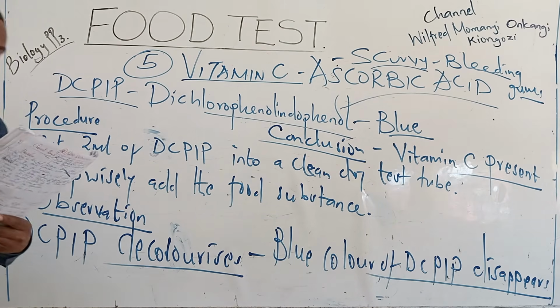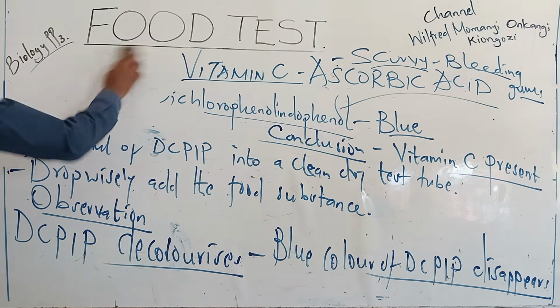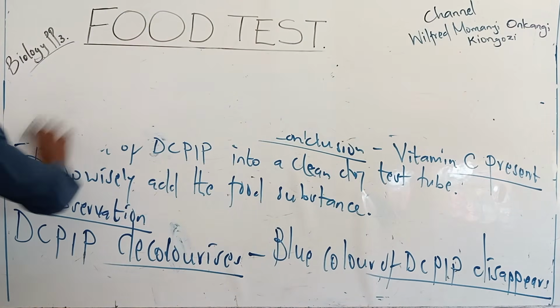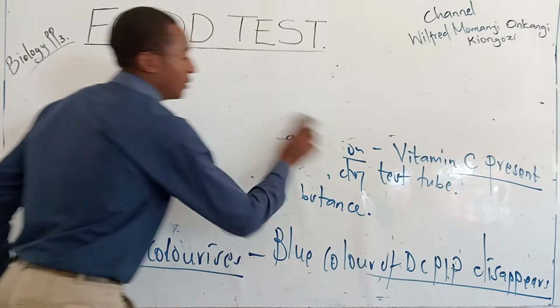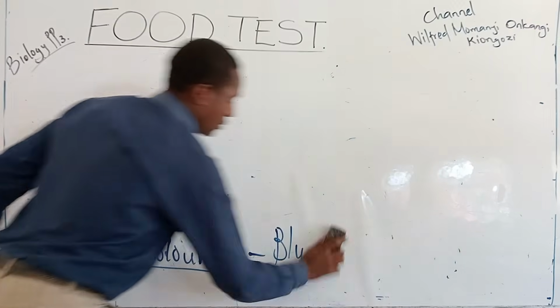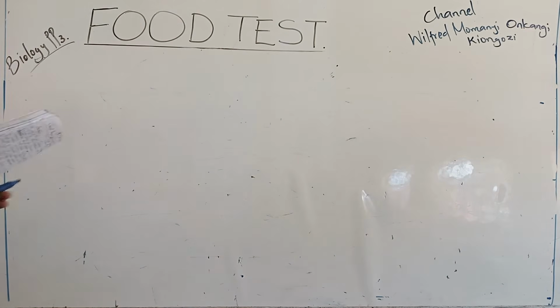Let us go to the last one. The last one is lipids. Very last in this video, lipids.